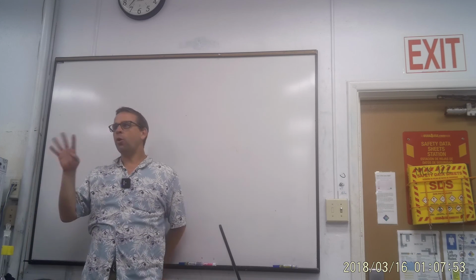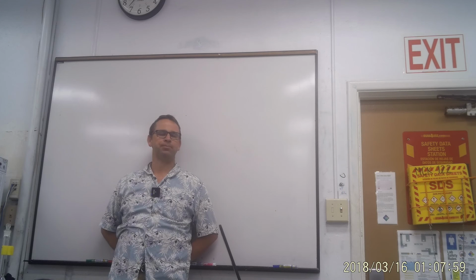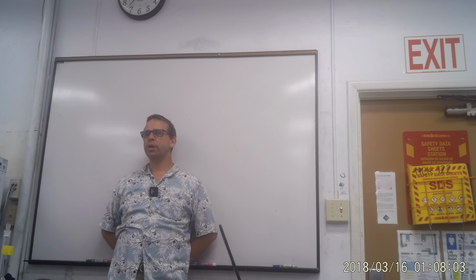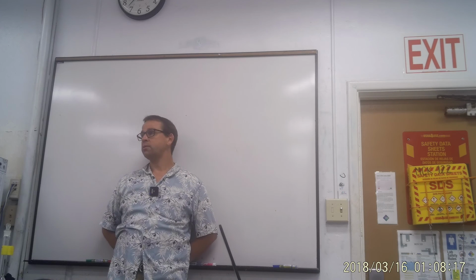All right, lab 4. What did we learn in lab 4? A titration. We did a titration. We determined the concentration of bicarbonate and carbonate in a solution. And I thought you guys did in a sample. So far, what I've corrected, you guys did really well. Maybe I haven't corrected too many, but you guys have done really well.